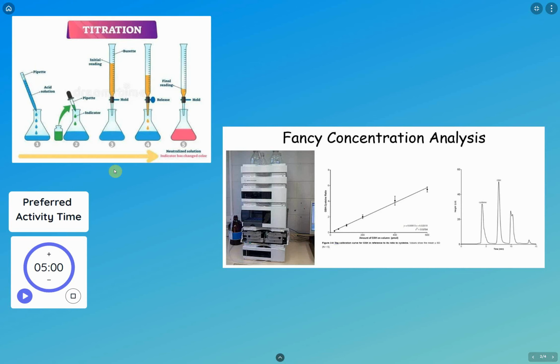So that is what you guys will be using in class, and this is what can be used in a scientific lab to figure out concentration. This actually is a cheaper, kind of old school way of figuring out concentration. Nowadays, what scientists use are things like HPLC machines, which is high pressured liquid chromatography machines. That is what I use for my master's, so this is actually an area that I have a lot of experience in.